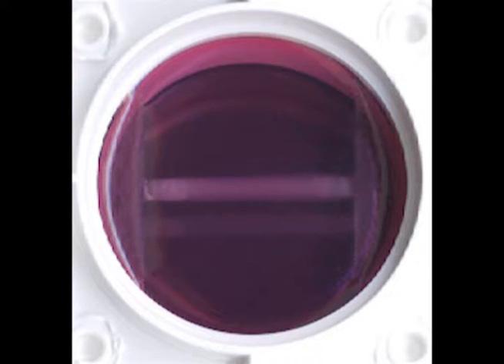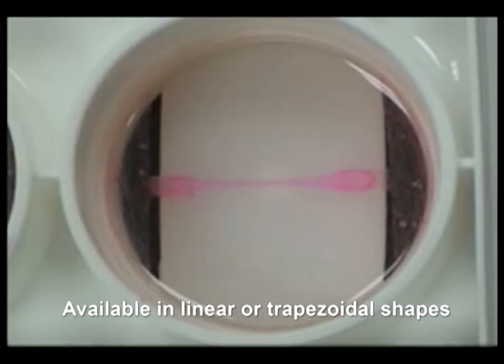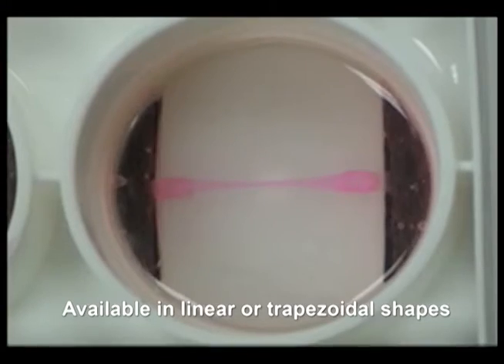After the collagen gel has polymerized, your 3D constructs are ready to be used in your research-based experiments. If desired, uniaxial strain can be applied to the constructs with the Flexcell tension system.